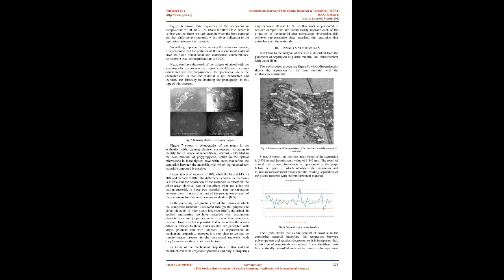Something important when viewing the images in Figure 6: it is perceived that the particles of the reinforcement material have the same dimensional and distribution characteristics, considering that the magnifications are 20x. Next, you have the result of the images obtained with the scanning electron microscope, Figure 7, in different magnifications established with the preparation of the specimens.